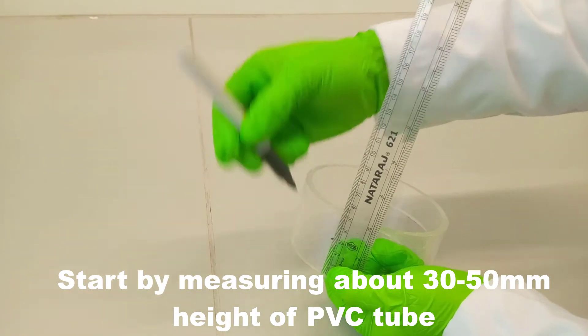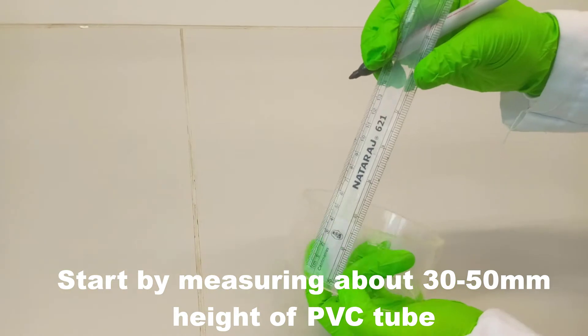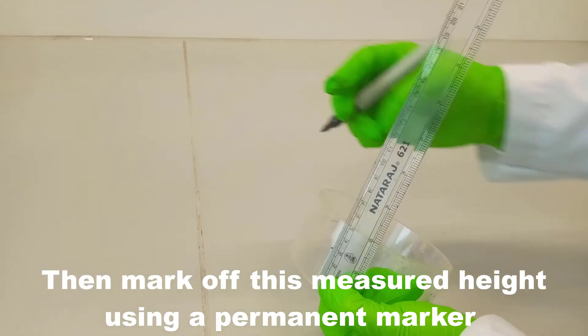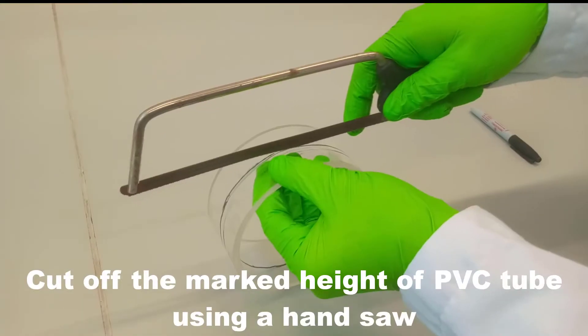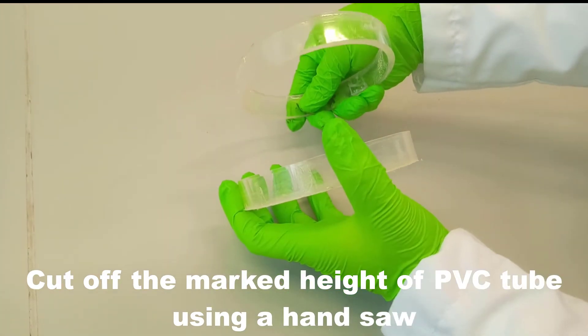Start by measuring about 30 to 50 millimeter height of the PVC tube. Then mark off this measured height using a permanent marker. Cut off the marked height of PVC tube using a hand saw.